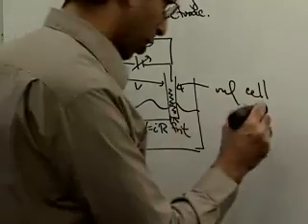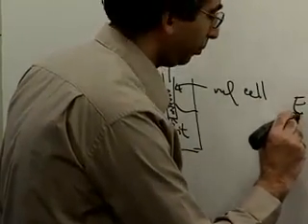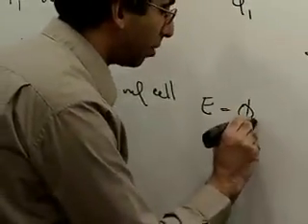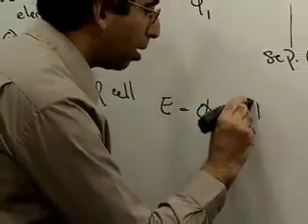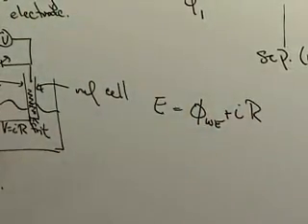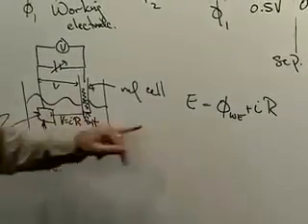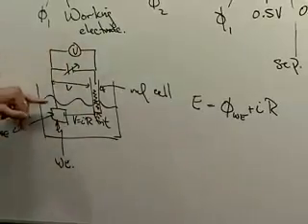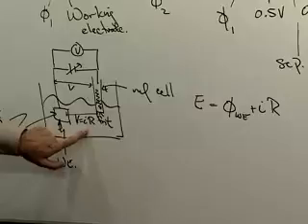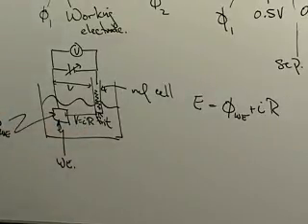That is, in general, the potential of the working electrode, E, apparent potential, is equal to the actual potential of the interface, phi working electrode, plus the IR drop, which occurs between that working electrode and whatever your reference half cell is. Okay. And in this particular cell, since I want to pass some current so I can carry out a reaction, I is going to be pretty large, and therefore I times R is going to be pretty large. Okay. So this cell works for a short period of time.